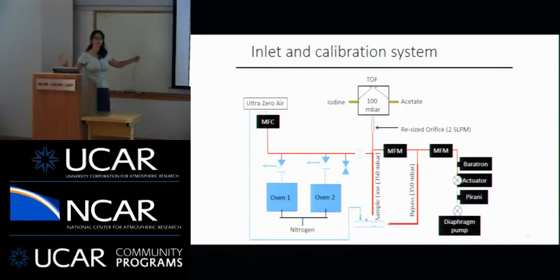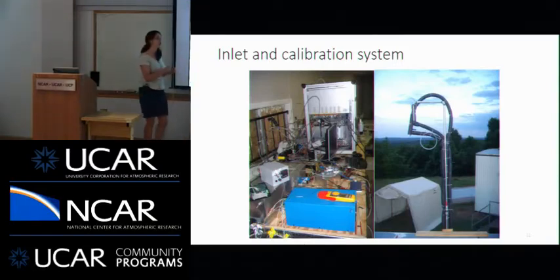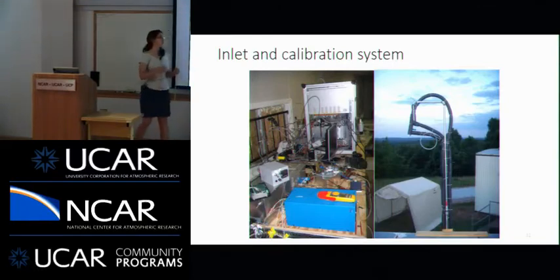So this is what the setup looked like, perhaps a little excessive. This was our calibration system. Most of it was designed ahead of time, but assembled in the field. This was our inlet, and the key thing about our inlet is that we have a huge bypass. So we pulled air through our inlet really quickly to minimize loss. We sampled air from a different line so that we would exclude particles.